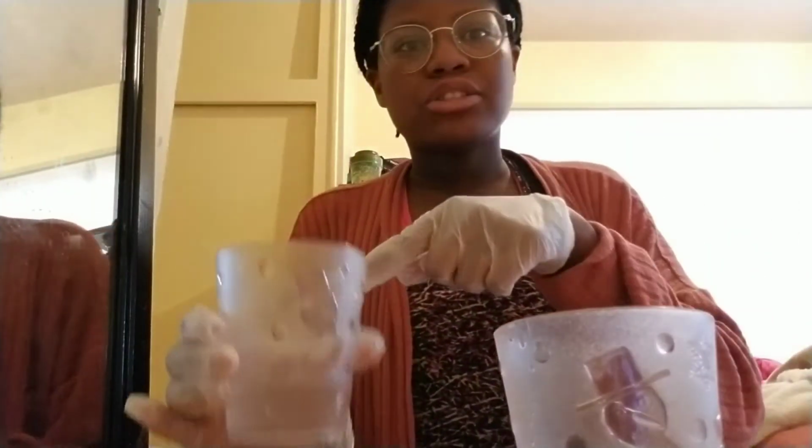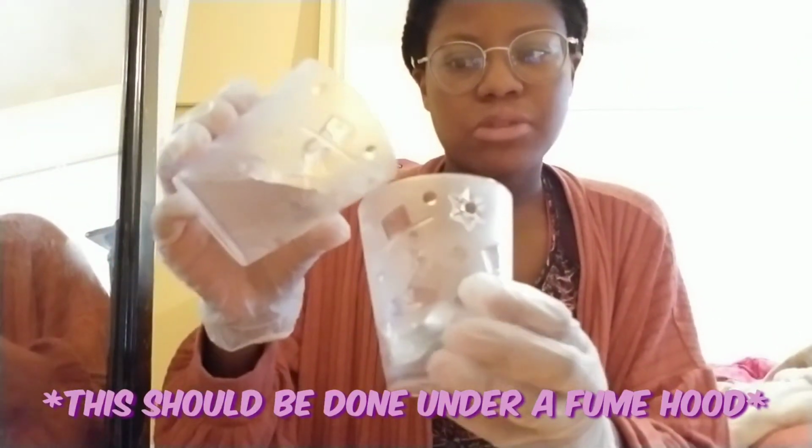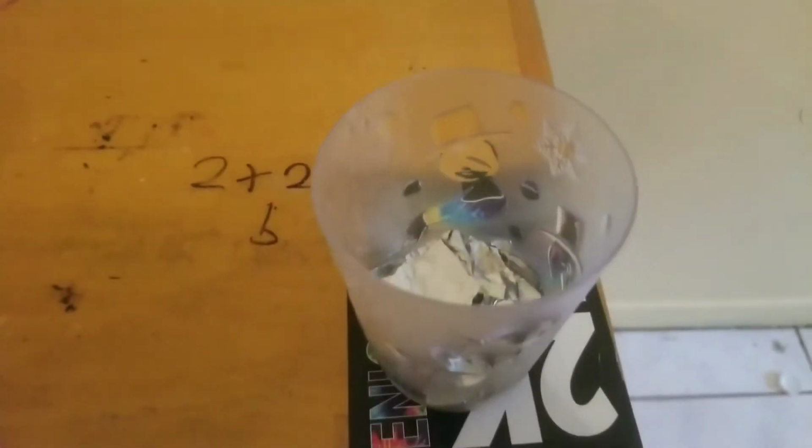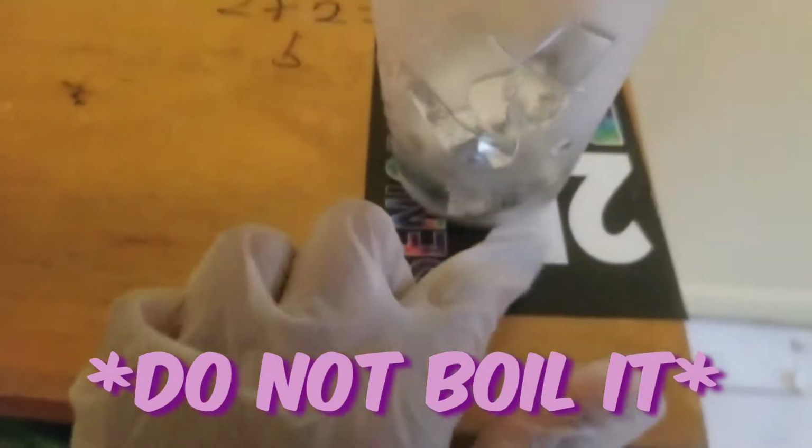10 milliliters of 4 moles of potassium hydroxide was measured with a graduated cylinder and added to our beaker, which we will then place into this beaker that contains the aluminum. Heat the mixture for 15 through 20 minutes on our hot plate.